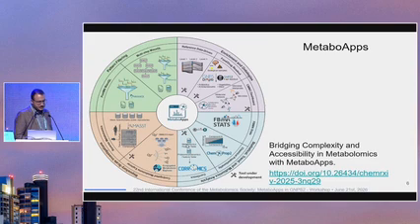And the fourth section is the repository scale investigation. And the main tool for that is the MASST. So it's the mass spectrometry public repository search tool. And for that, we have already some other tools that are based on the same idea, which are the microbiome MASST, the microbe MASST, and some other tools that you can search on the website. And I'm going to discuss a little bit more on how to access those tools beyond the ones that we are going to see in detail today.